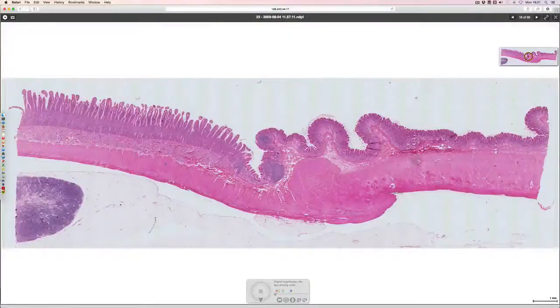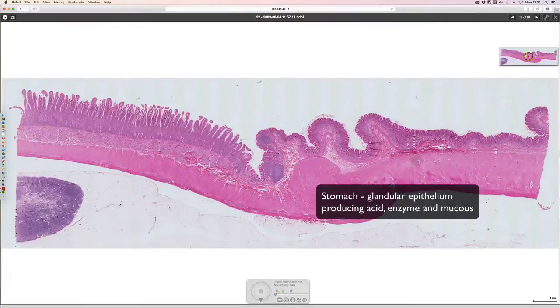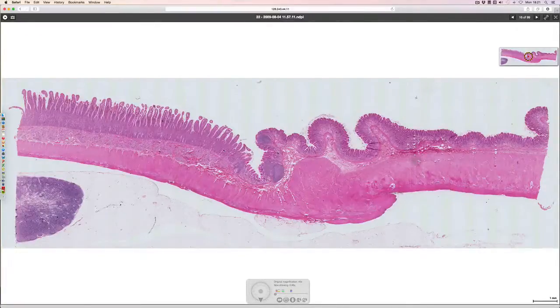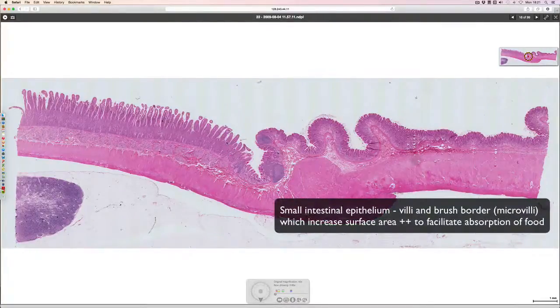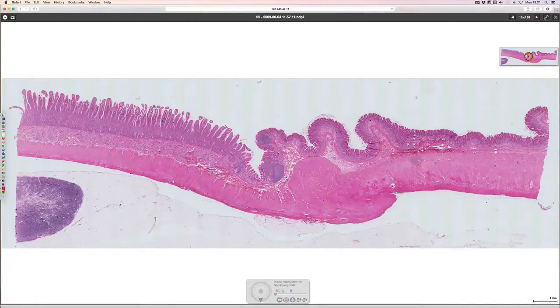Zooming back out, we can see quite a difference between the glandular structure of the epithelium in the stomach — with the pits containing acid-producing and other enzyme-producing cells and a mucous-producing layer at the top — and the small intestine, where there are many folded villi whose surfaces contain enterocytes with microvilli, all extending the surface area by a large order of magnitude to facilitate absorption. We have gone from mechanical and enzymatic breakdown in the stomach to absorption and digestion in the small intestine.